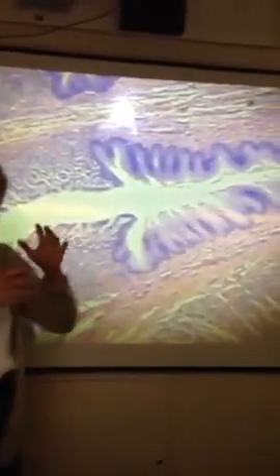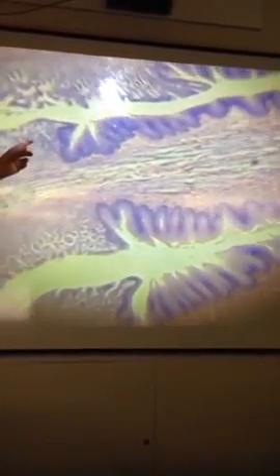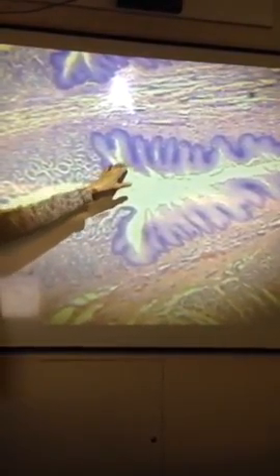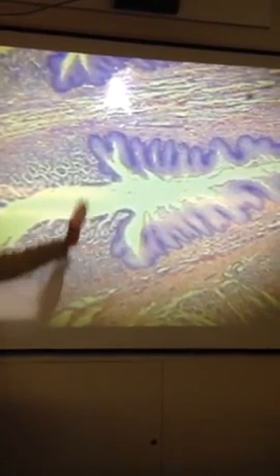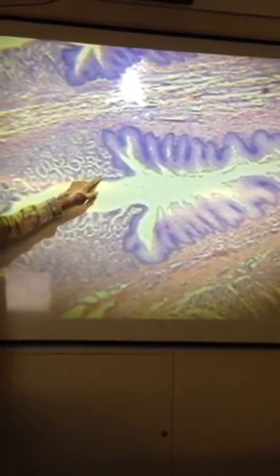So in the esophagus, we have stratified squamous with many folds in it. As you look at some of these slides, you'll see fold after fold of the esophagus. Don't let that throw you off. Just look for that stratified squamous. And then an abrupt change to what I'm going to show you is simple columnar cells. You really can't tell at this magnification, but I'm going to show you.